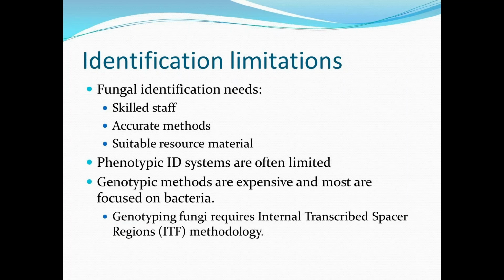The problem again is that there's no standard guideline on types of agars and identification methods. Many commercial phenotypic systems cannot readily identify fungi except for a narrow range of yeasts. Genotypic systems are often expensive and beyond the scope of many laboratories.